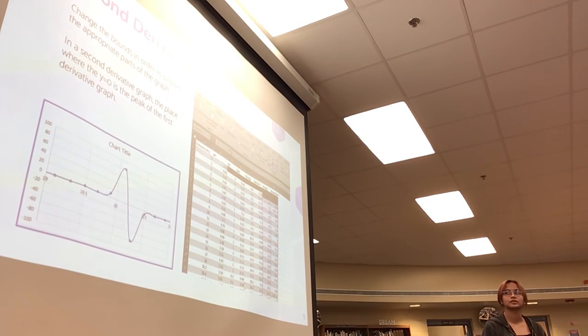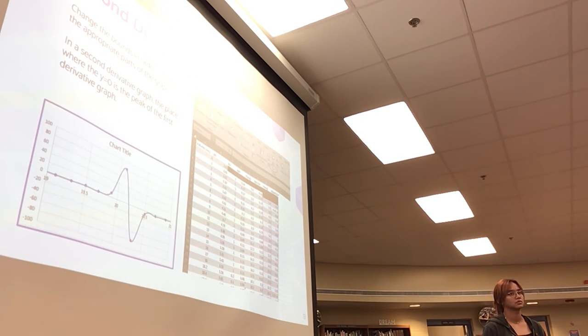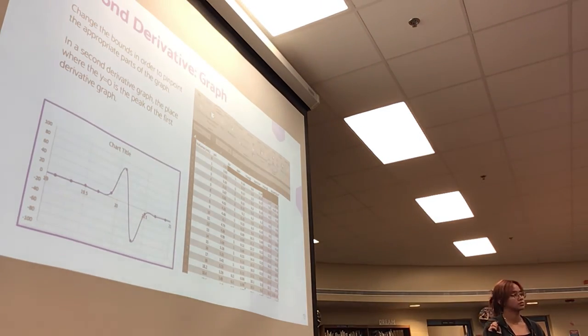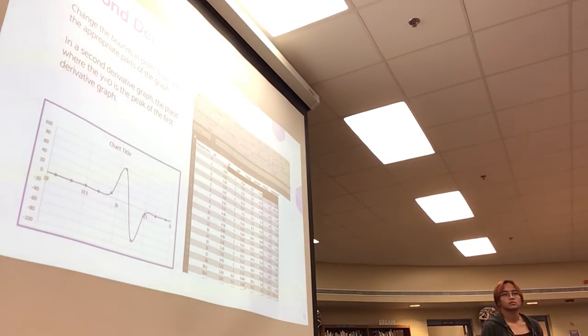So in terms of that, could we just skip the first derivative graph, do the math for it, and go straight to the second derivative graph? I think in the guidance that I gave to you, you need to go over the three graphs. Okay. And do you want us to attach formulas to the graphs? You can check the guidance that I already gave you. This is only a general guide. She didn't know the experiment at all. She has raw data, and then she made a trial. She doesn't know anything, so it's only about how to use Excel to do this.